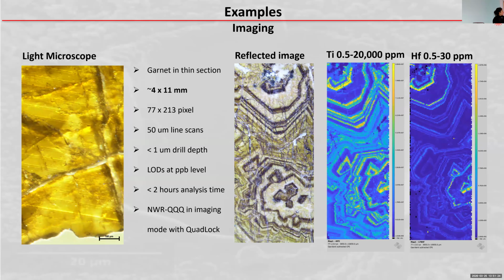And another thing, you can see how light it is. The drill depth is less than 1 micrometer. It's extremely light, which is very great if you want to have a good idea about some sort of surface coating or any surface features.